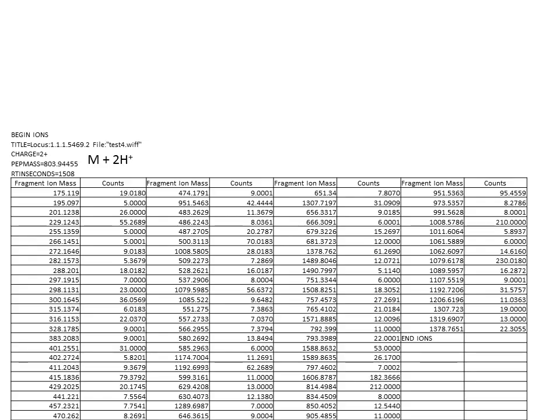So a peak list was generated from the raw data file from the mass spectrometer, and this is one of the peptides in the data file. The mass of the intact peptide is 803.9 Daltons, and it is a doubly charged ion. When we submit the peak list to the search software, it will generate its theoretical peptide list and then look at the entries in the peak list. The software will note the mass of 803.9 Daltons and convert it to its uncharged peptide mass of 1605.8.